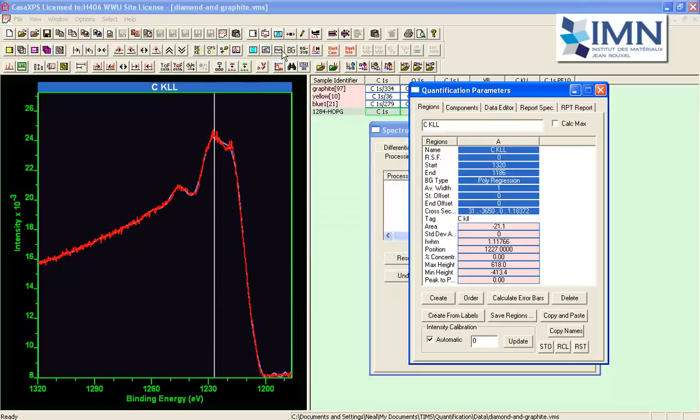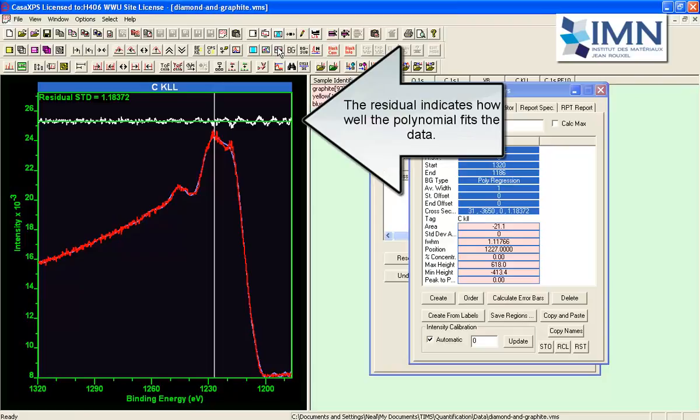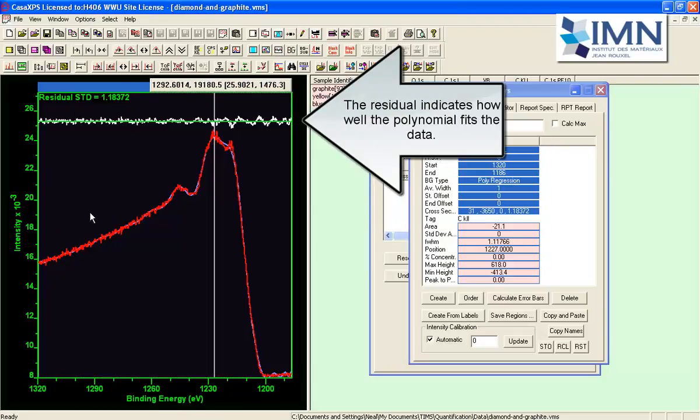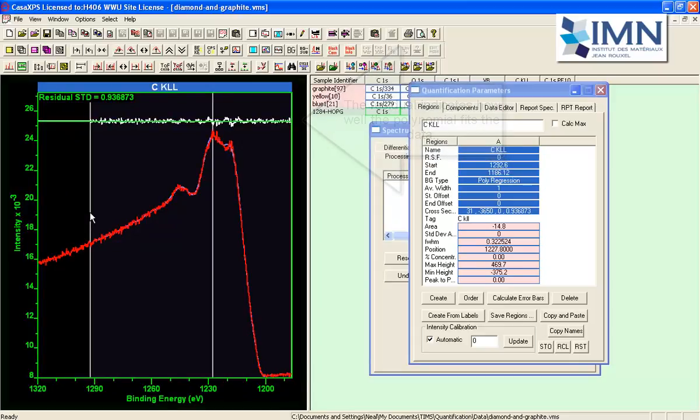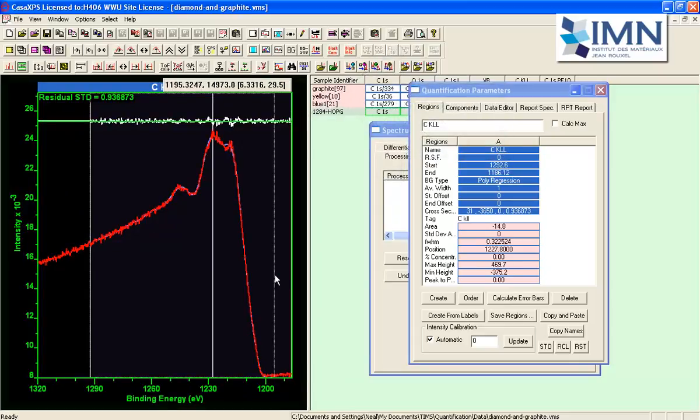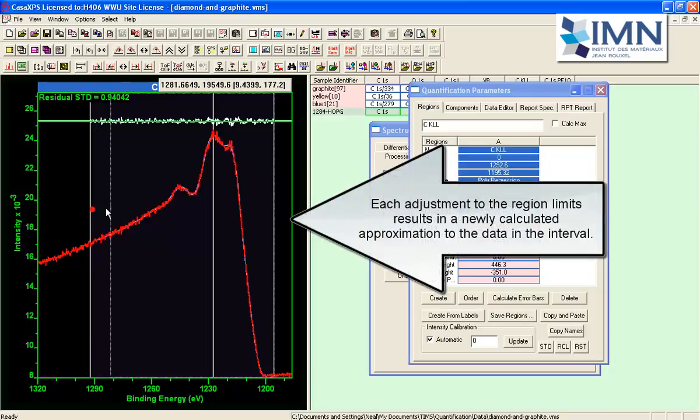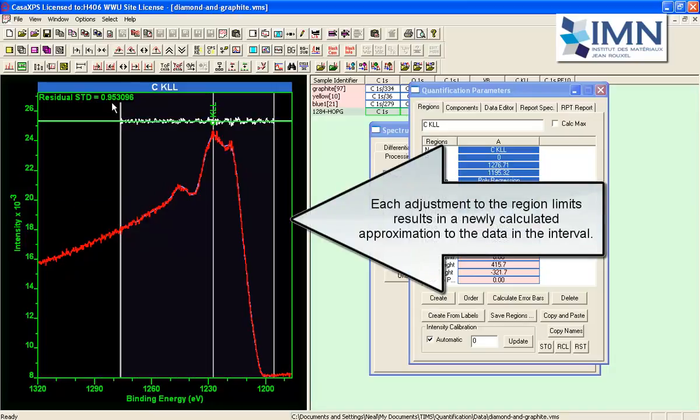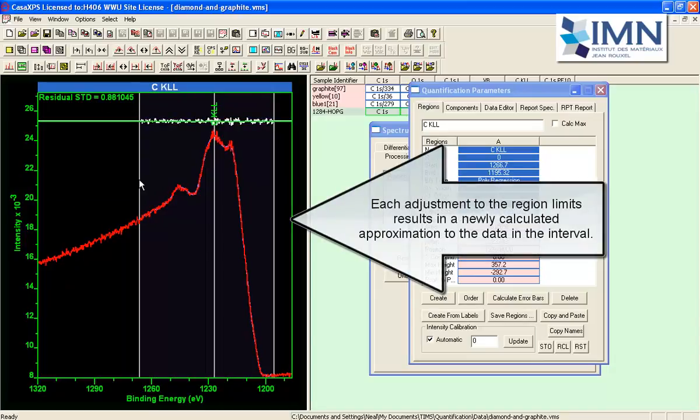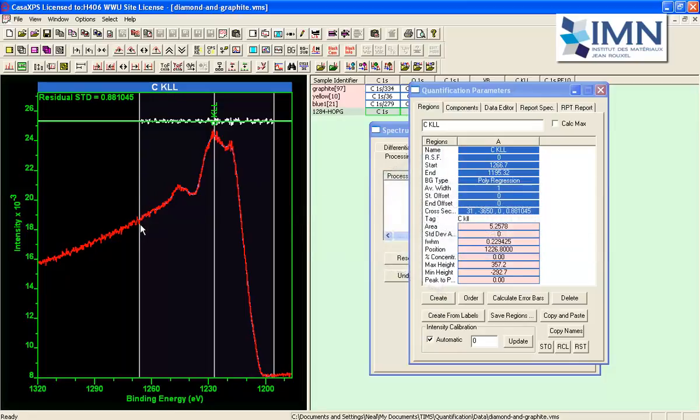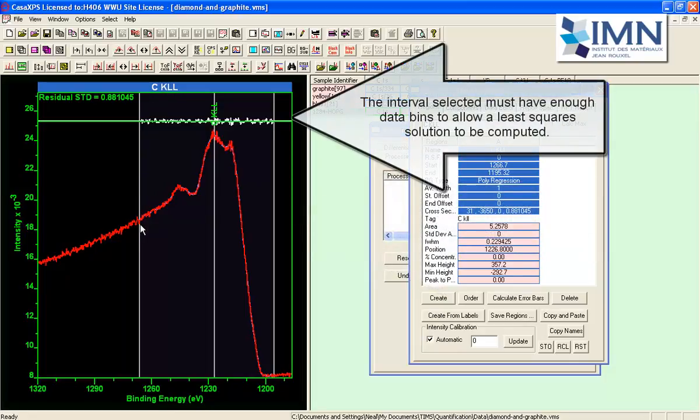And you can see how well this polynomial is fitting the data by looking at the residual. And if I restrict the range over which the polynomial needs to fit the data I can see how the residual improves as I shrink the interval.